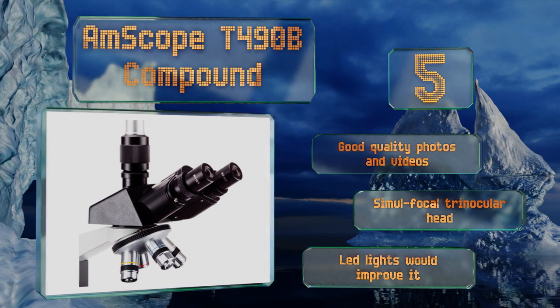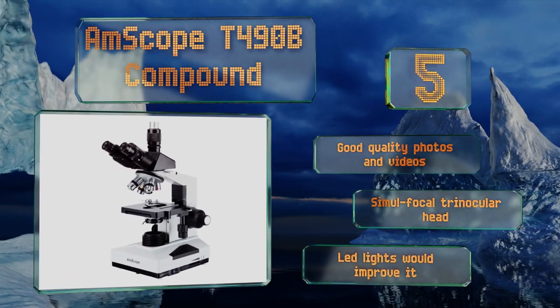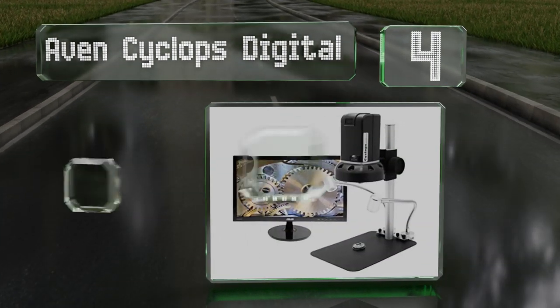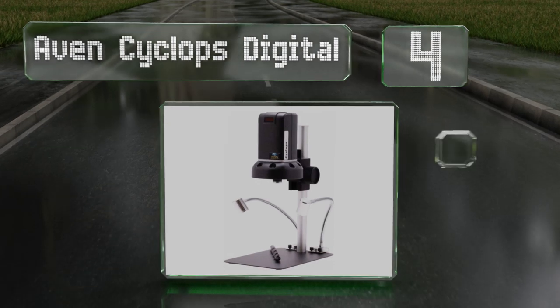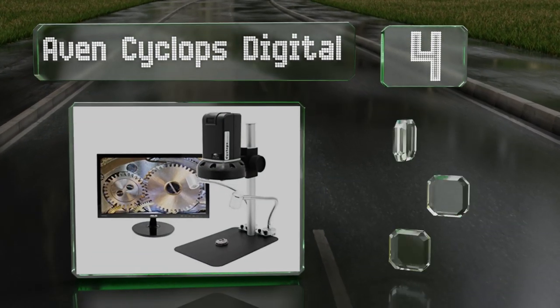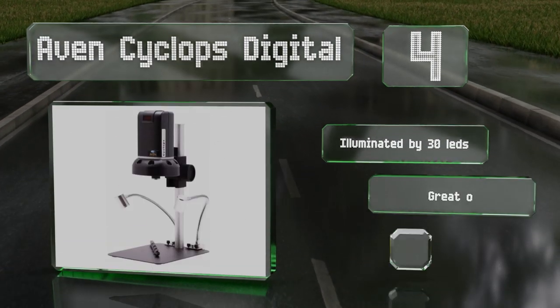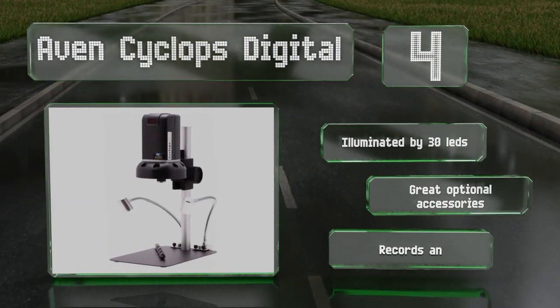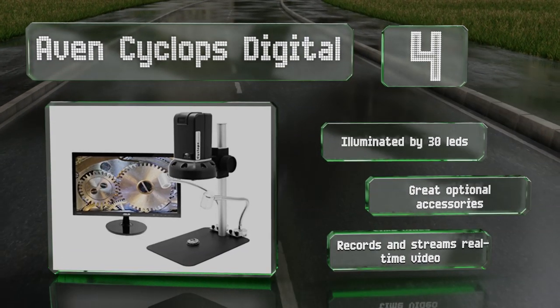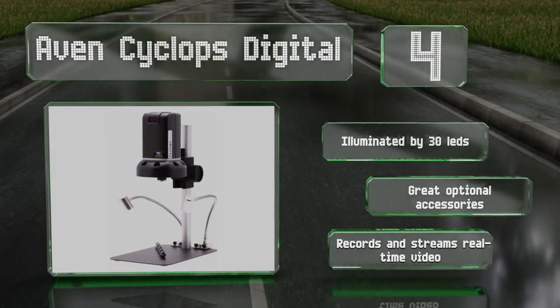At number four, the Aven Cyclops Digital comes with a handy remote control and uses a four times objective to produce up to 534 times magnification. It's perfect for presentations or field applications and can view areas ranging from one to nine and a half inches across. It's illuminated by 30 LEDs and there are great optional accessories. It records and streams real time video.